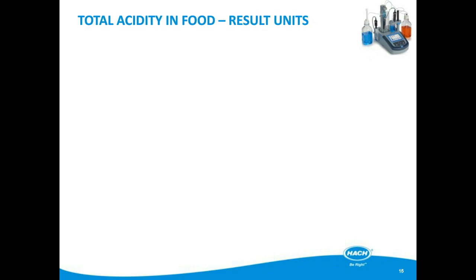Regarding the result units, at the beginning, the first result will be initial pH. This is the pH value of the sample before starting the titration. At the end of the titration, the titrator will calculate all results in different units.